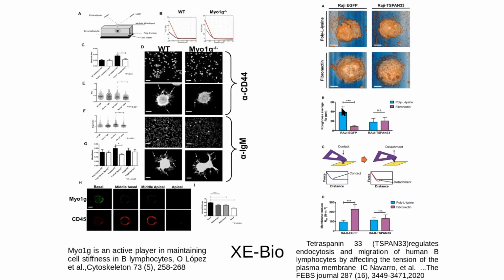So what we did is to determine the morphology and the elasticity of lymphocytes, in the presence or absence of particular proteins, and how this relates to the process of lymphocyte action. So this is just getting the nanomechanical properties of the cells, and they have this effect.